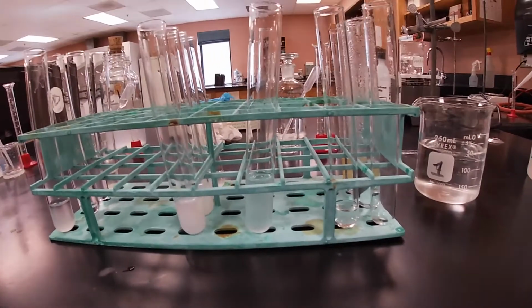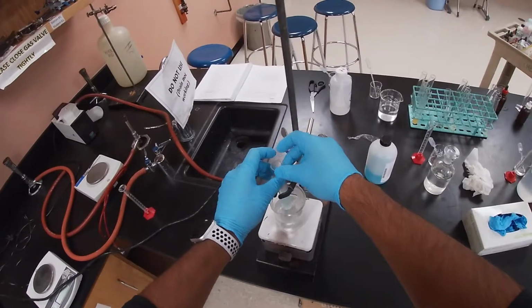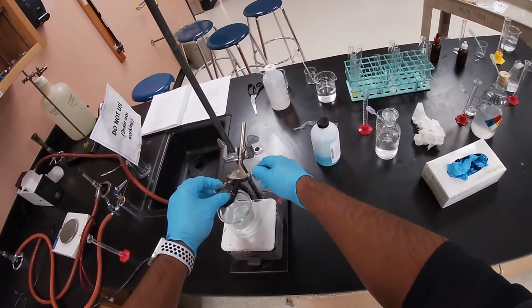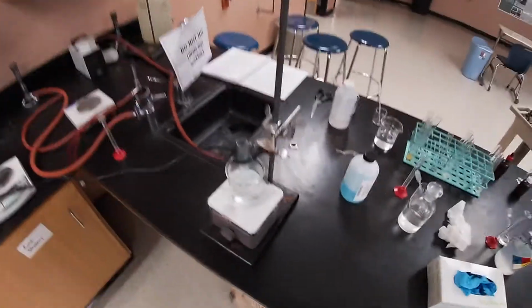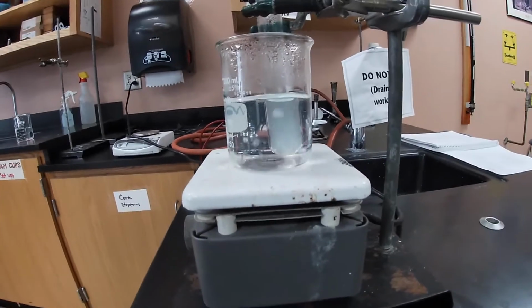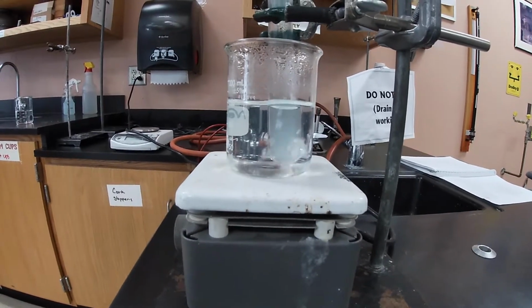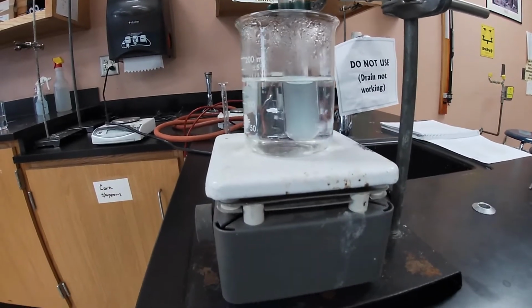And so now we're going to go ahead and move over to our water bath. As you can see, we're going to submerge our substance in the water bath again. And we're going to wait for about 5 minutes and then come back and check it out and compare our results to our standard.